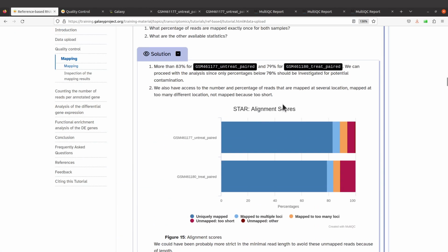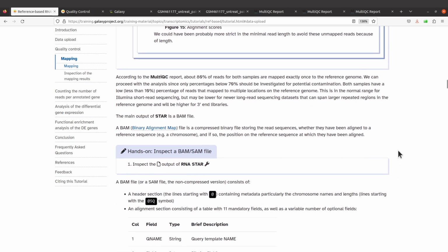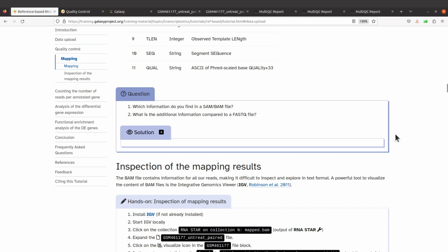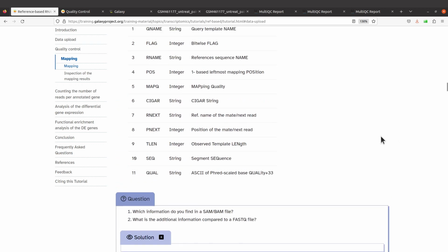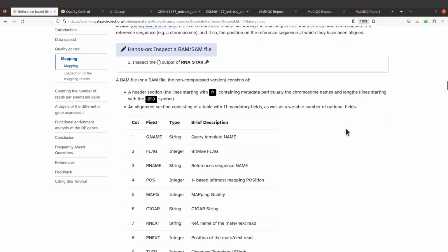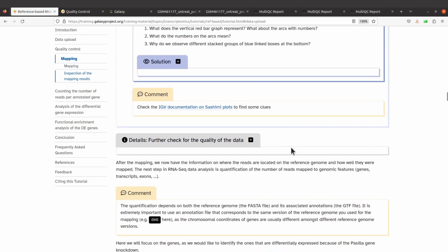Now with RNA-Seq, after performing the mapping, one of the things you can do is get the read counts. You can use tools like featureCounts to do that, and I've covered a tutorial on that. Even before you use featureCounts, you need to determine the strandedness. That is something I'm going to cover in another tutorial, but you still have that tutorial here, by the way.